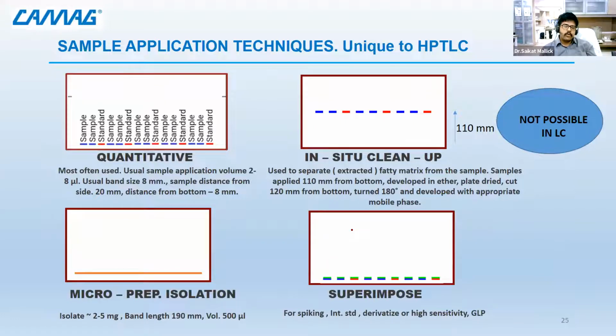After development, what you do is take the plate and dip it into an antimicrobial, a microbial culture broth. From that you remove it and allow it to stand for some time, which is known as the incubation period. After that you see the zone of inhibition. From that you can identify what my zone of inhibition is and how the antimicrobial compound is acting.